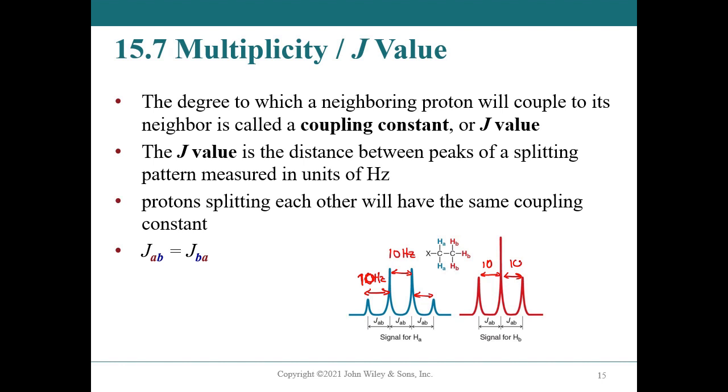And the coupling constants are always in hertz. They're called a constant because it is constant in hertz. If you have a particular molecule, say ethanol, and you have an 8 hertz coupling between two peaks, it doesn't matter which instrument you collect the spectrum on, it doesn't matter what the magnetic strength is, the coupling is still going to be that same 8 hertz for every instrument. The ppm difference will change because of the strength of the magnet, but the hertz does not.